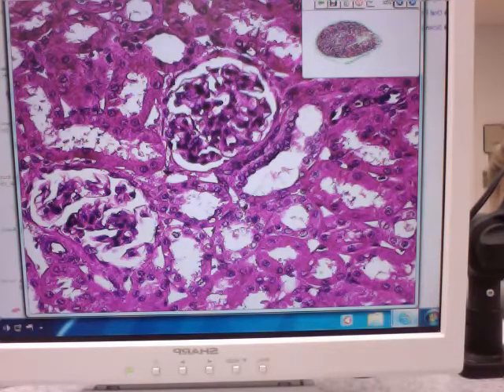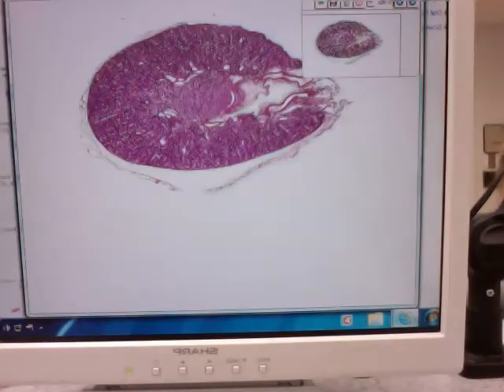Okay? And on the lab quizzes, anything that we do, we'll give you really good examples. It's not going to be one that you're trying to decide is it cuboidal or columnar. It's kind of like this one. Maybe you kind of think it's starting to get columnar in shape. It'd be a really nice example. So squamous, cuboidal in shape on this one. Okay?